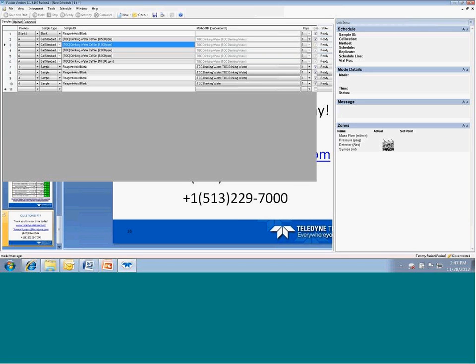It's going to give me a pressure reading, so it's enabled to do almost like a leak check on each and every sample, to ensure there are no leaks or anything in there that would possibly give us a false result.